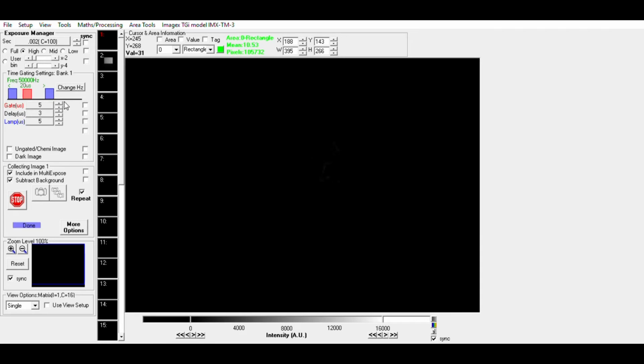So that's all the short lifetime fluorescence rejected. Now let's increase the exposure time to collect more of the long lifetime europium emission. If we go back to the original settings, we can see what a huge difference it's made to the image.